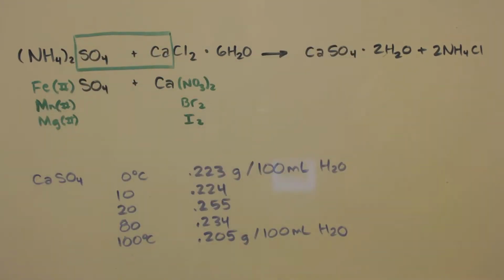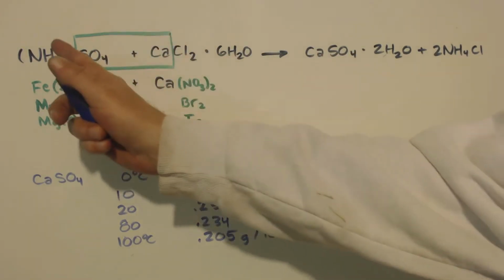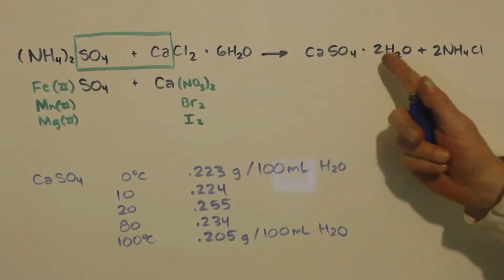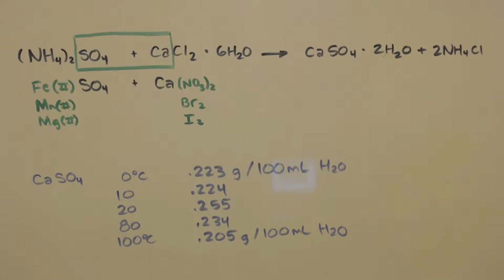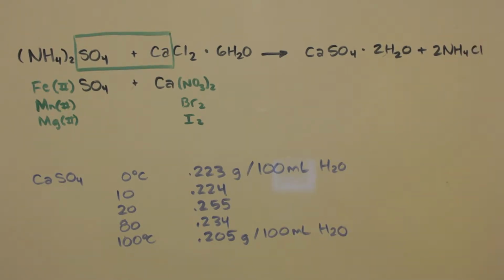Now you mix the two aqueous solutions together, and you get all these ions: calcium, chloride, ammonium, sulfate. Calcium sulfate is not very soluble, so it's going to precipitate out. Ammonium chloride is soluble, so those ions stay in solution. You can let it dry, put it in a flat pan and let it evaporate naturally. Leave a little bit of water in there so it soaks up the impurities, filter these crystals out and wash them a little with water, and you've got pure ammonium chloride.